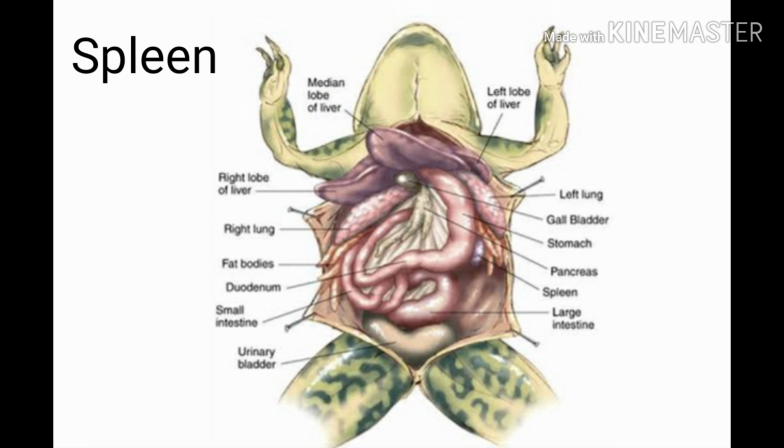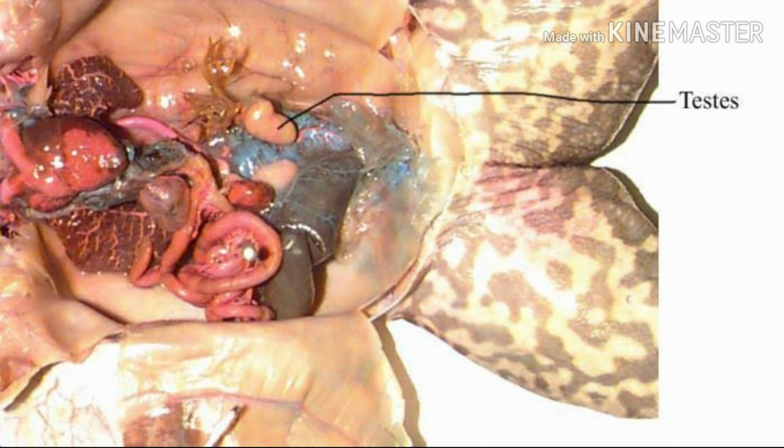So, the spleen is a rounded dark red gland embedded in the mesorectum, by which the large intestine is suspended to the body wall by its mesentery. And the kidneys, one pair, are elongated organs, dark brown in color. They are the ones that filter the blood.